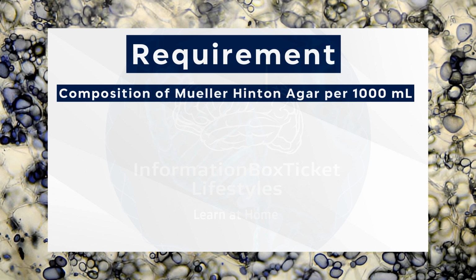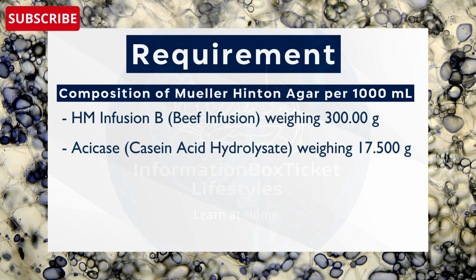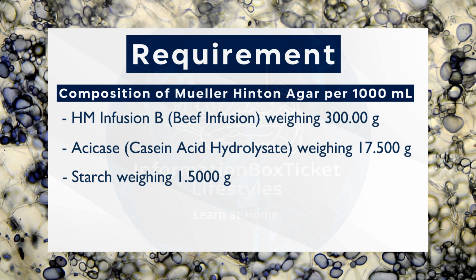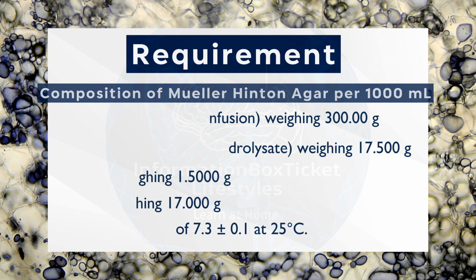Composition of Müller-Hinton agar per 1,000 ml: beef infusion, 300.00 grams; casein acid hydrolysate, 17.500 grams; starch, 1.5000 grams; agar, 17.000 grams, with a final pH of 7.3 ± 0.1 at 25 degrees C.